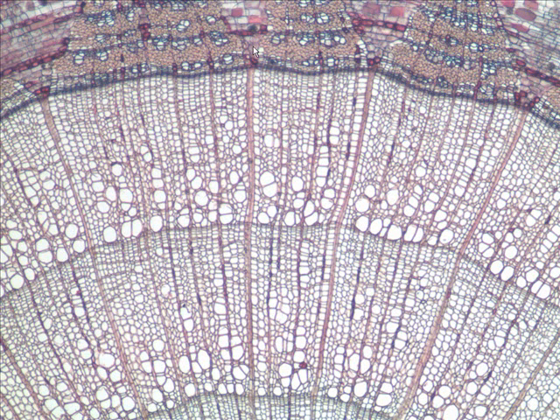Yes, secondary phloem. So the vascular cambium makes one layer of xylem cells to the inside, one layer of phloem cells to the outside. Xylem, phloem. And the xylem gets a lot thicker, and why is that? Because it's tougher stuff, tougher cells. And so the phloem is made up of a much higher percentage of flimsy stuff, even in woody dicots like this one. All right, so this was what? The youngest or the oldest ring? This was the youngest ring of secondary xylem.